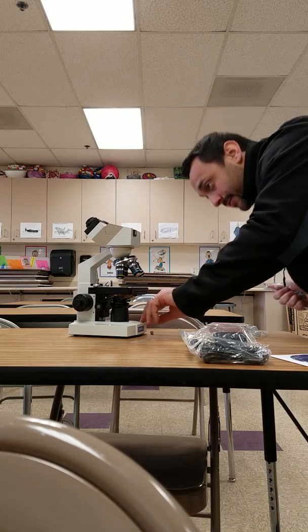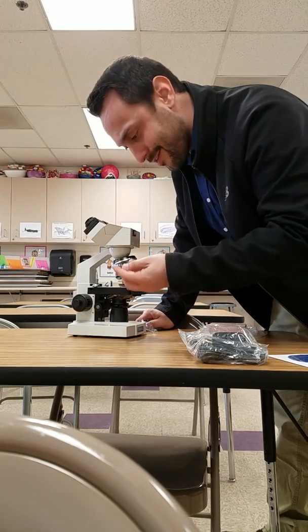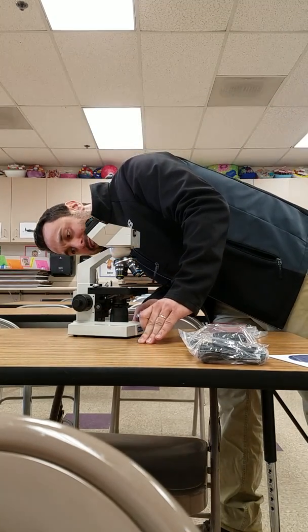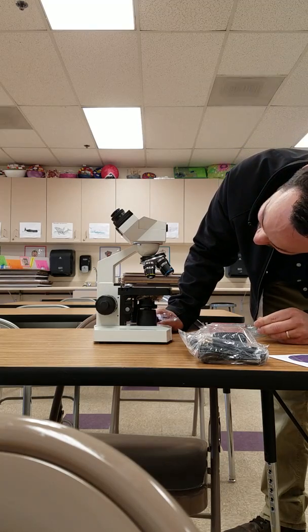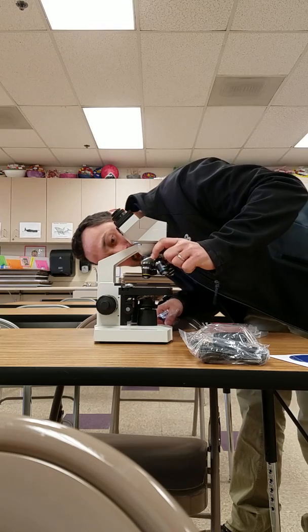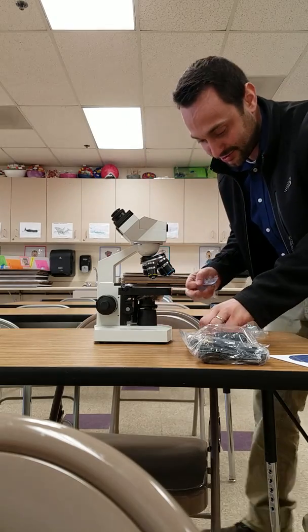We'll just have to leave that on for now. I have no idea what this thing is for — it looks like it's supposed to screw in somewhere, but I don't know where. So maybe that's what the instructions are for.